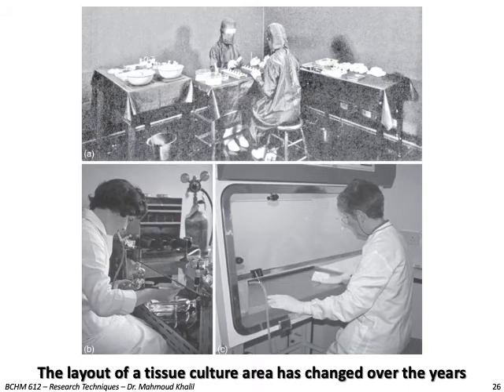You can see here the layout of a tissue culture area has changed over the years. In the top figure, you can see how ages ago they were working on cell culture, and then they moved to work over a bench and then inside a hood. Recently, the image will look different.